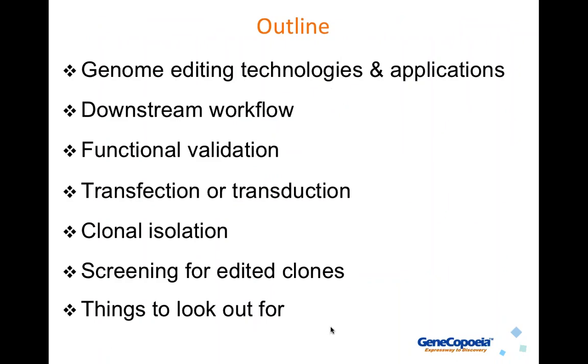So here's an outline of today's seminar. I'm going to first go over genome editing technologies and applications, the cool things that you can do. Next, I'm going to talk about this downstream workflow for how to use CRISPR in stable cell lines. Then I'm going to talk about the importance of functional validation for CRISPR. Then transfection or transduction, followed by clonal isolation. This is a very important concept that I'm going to spend significant time on. Next, I'm going to talk about what to do for screening for edited clones. And finally, things to look out for, various pitfalls that can come up during your genome editing work.